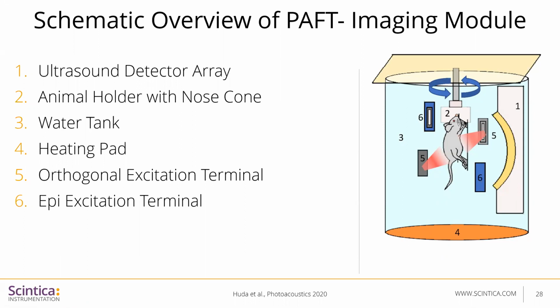The system has a field of view of 30 by 30 by 30 millimeters with a spatial resolution of 150 micron, provided by the PhotoSound manufacturers.